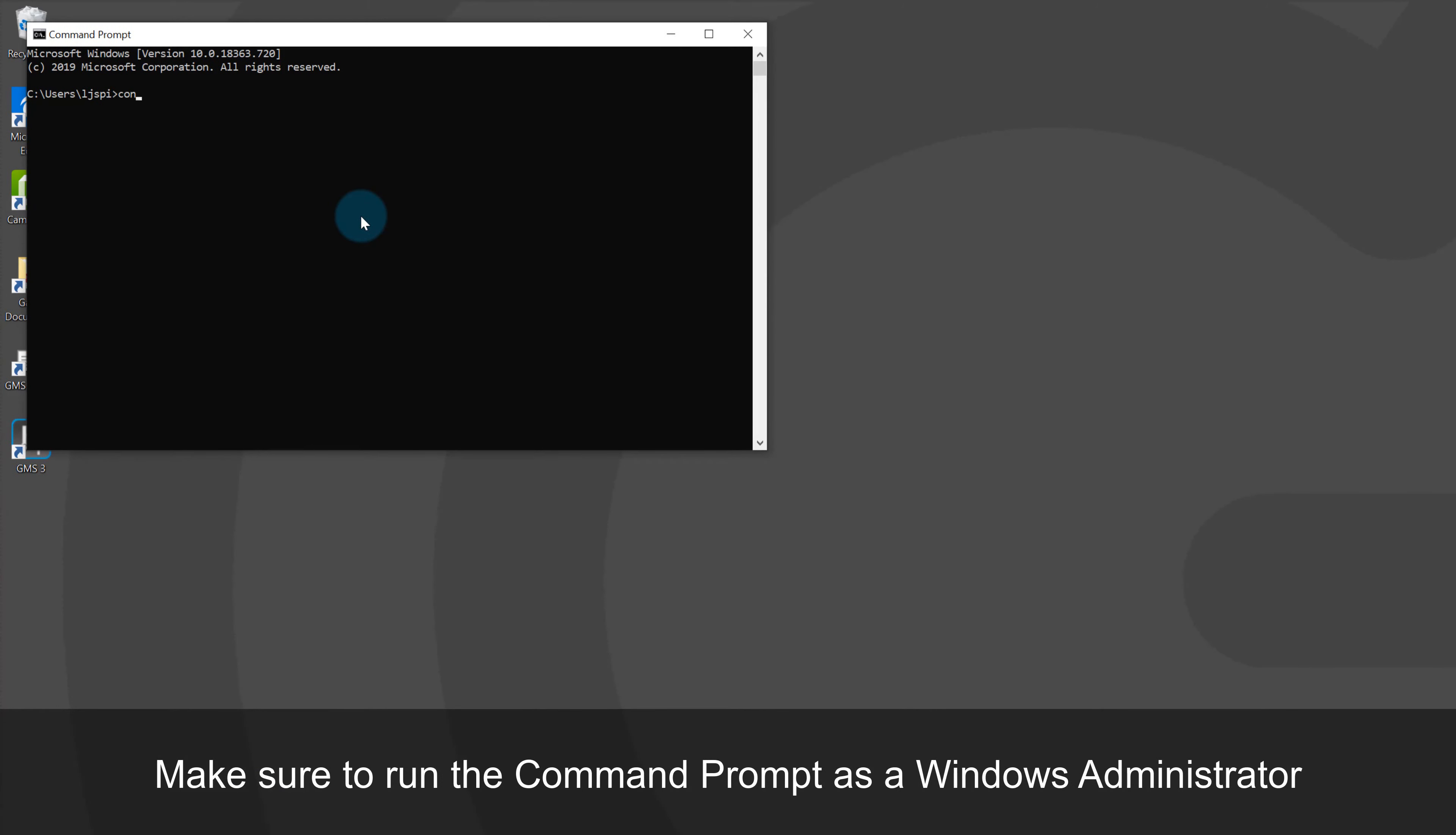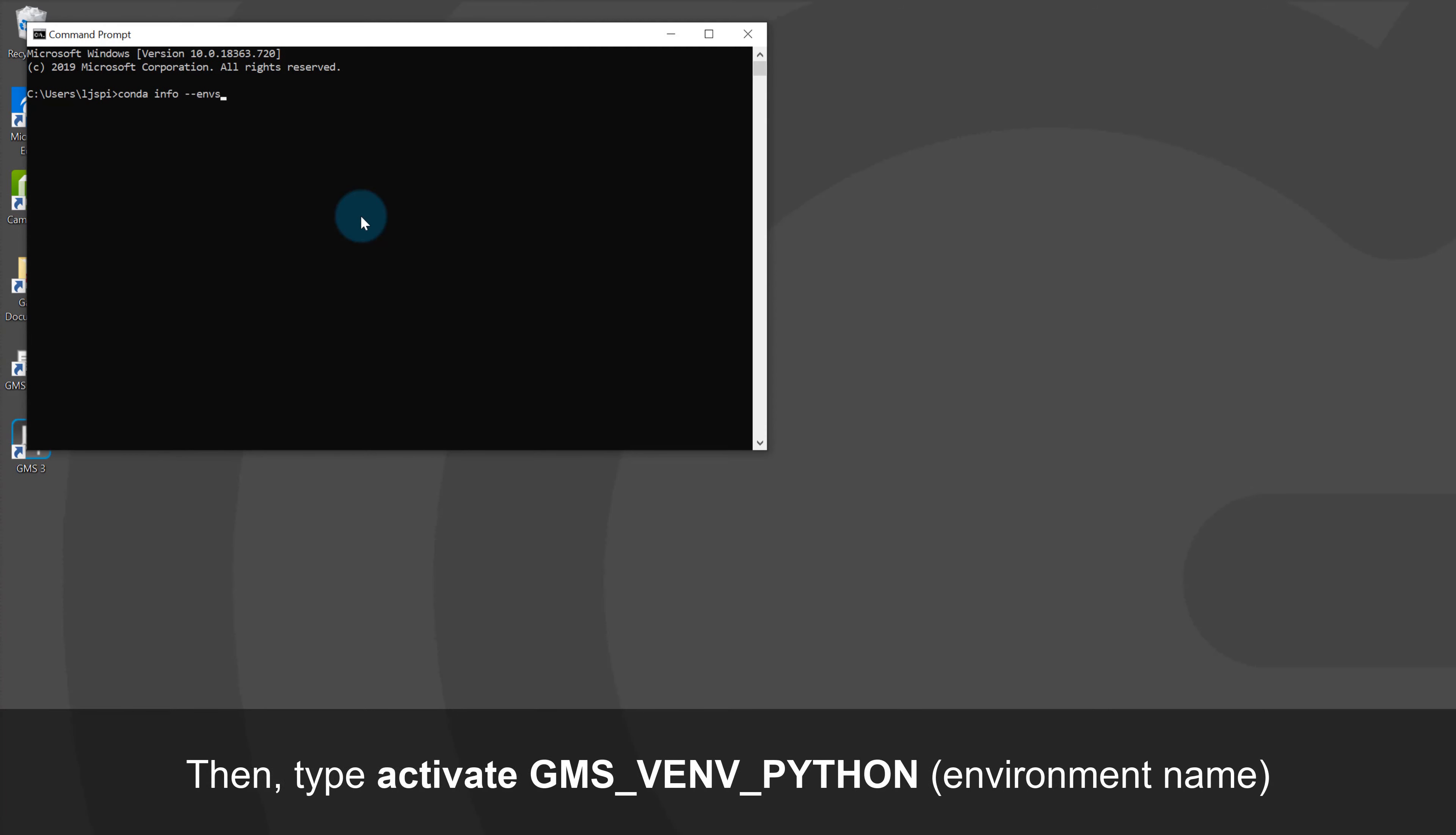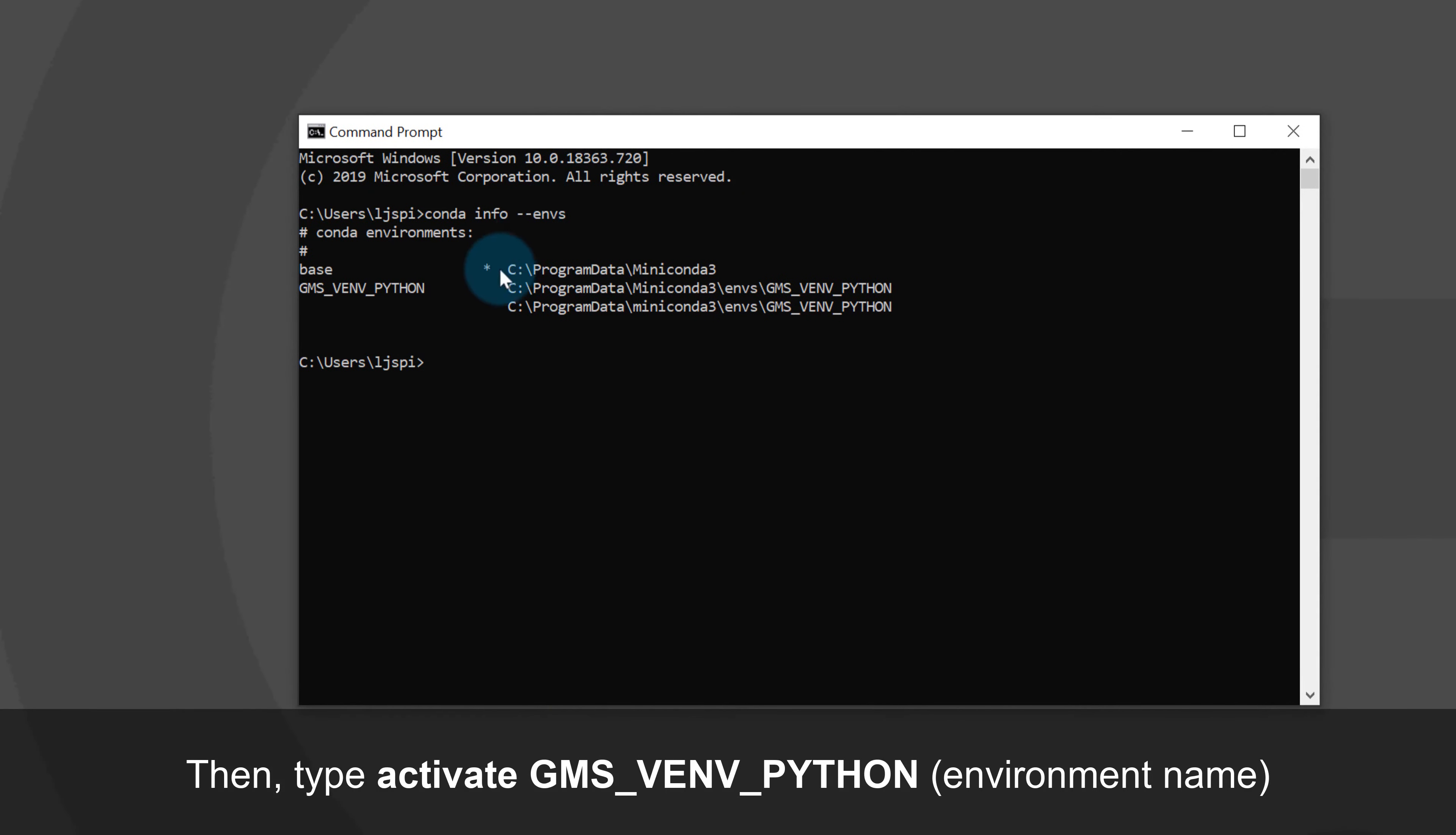In order to see which environments are present, just type the command conda info --envs. I want to make changes to the GMS Virtual Python environment, so I activate this environment by typing activate followed by the environment name.